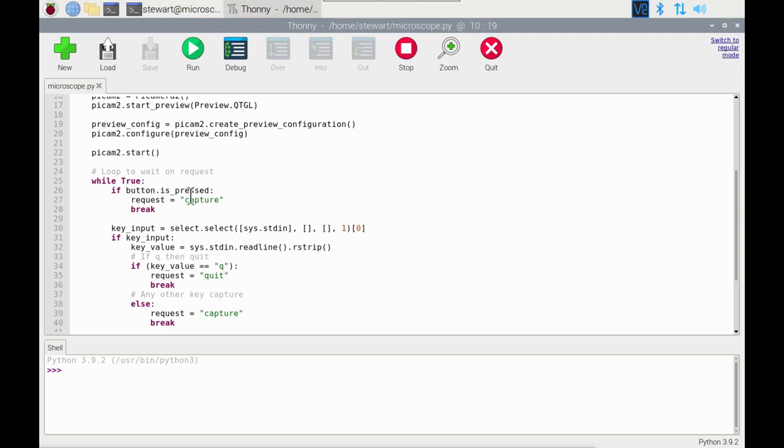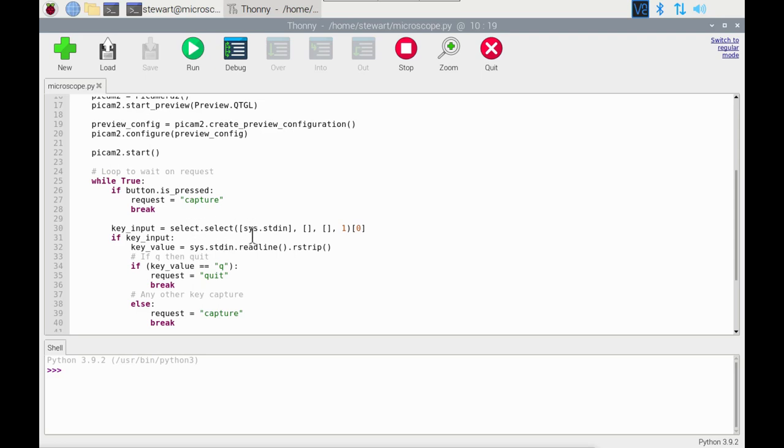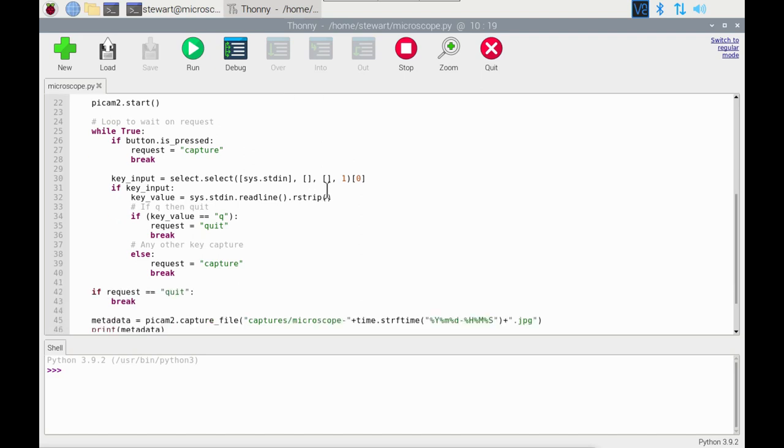So the significant parts are it uses GPIO Zero for the button press, and this is the part that does that. And it uses select.select for the key input. Python's a little bit frustrating - it doesn't have an option just to look at whether any keys have been pressed without locking the code up. So that's what this does, it just looks to see if a key has been pressed, and if so then it uses readline. The only thing with this, it does need you to hit the enter key. You can't just press Q and quit straight away, but it does the job that I wanted for here.